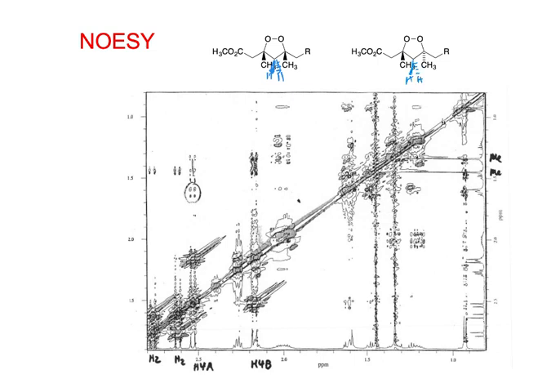And we're going to look at the NOEs from them to see which of the methyl groups are close to them, okay? And we might imagine that, say, for this system over here, both methyl groups are up on the same side, so they might show NOEs to one of these protons but not the other. And in this case, the methyl group that's up might show an NOE to the proton that's up, and this methyl group's down to the proton that's down. Okay? So let's look in here.